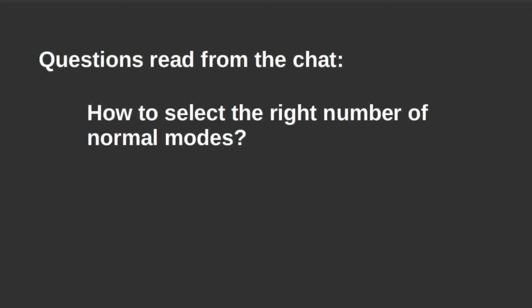It is true that this is the most difficult step in this whole procedure. But globally, today we have more computer power, and we are able to work with more modes than before. I tested this recently, and you can really include more modes if you reduce the size of the image, and then your analysis will still be fast.